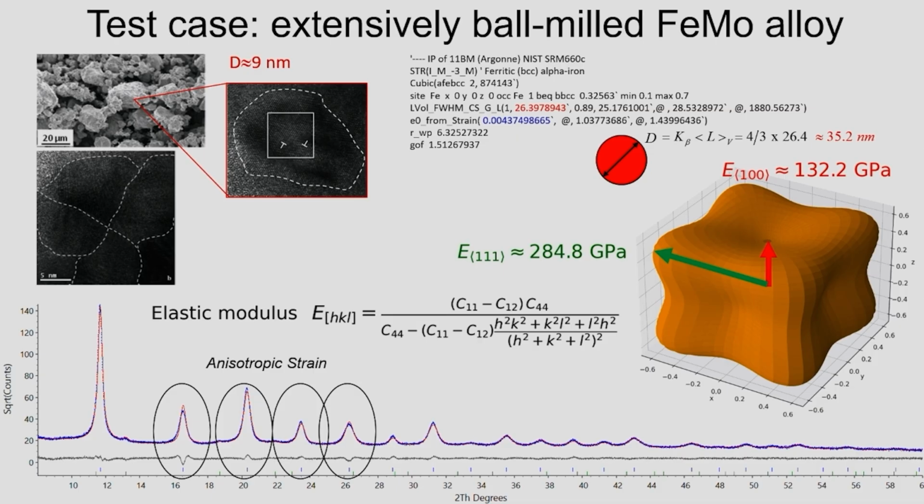They tend to be on some specific high-density planes with specific high-density directions. So in addition to the crystal anisotropy, which is in this equation, you should also include the defect anisotropy. And which defect? Well, it depends on which defects you are dealing with. So this approach is good, but it's not complete, it is not going to work perfectly well.